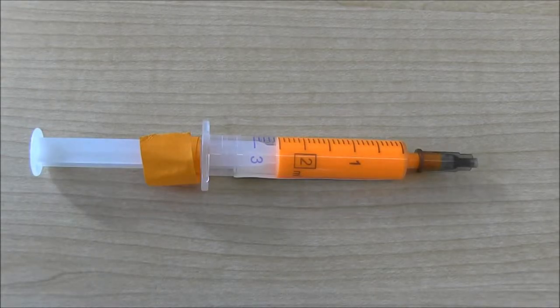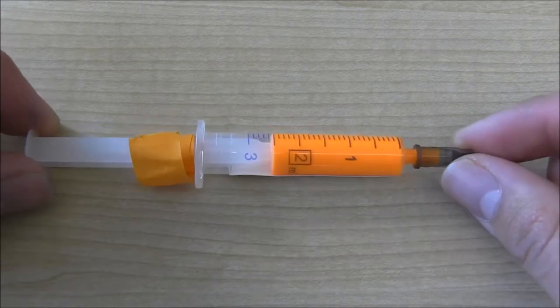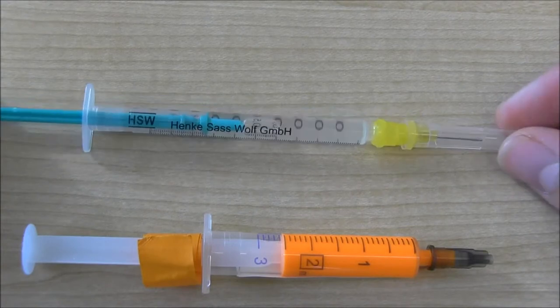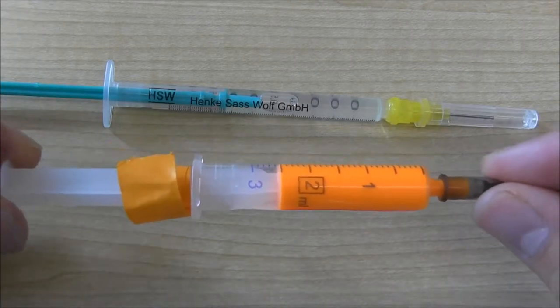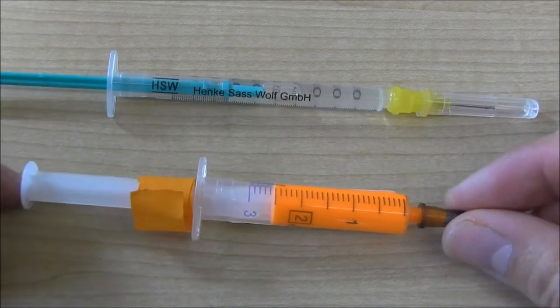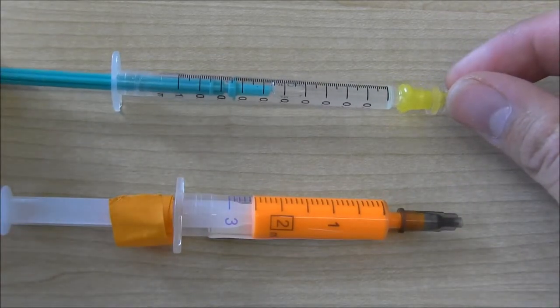Next, let's inspect the elastomer syringes. The dye syringe is marked in tenths of a milliliter, while the curing agent is marked in hundredths of a milliliter. That's because whenever we mix this there needs to be a ten-to-one ratio — ten parts dye to one part curing agent. That means all we have to do is put in one dash mark's worth of dye and one dash mark's worth of curing agent.